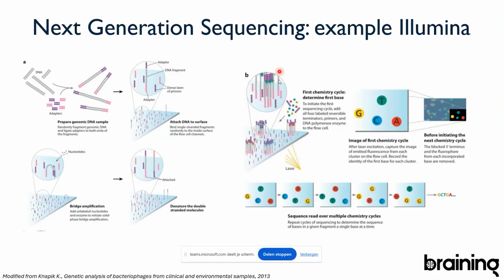And that real sequencing step works in a very similar way as Sanger sequencing. You have some kind of chain termination, right? The difference here is that you use fluorescently labeled bases. So for example, here the guanidine will be yellow, the thymidine will be green, the cytosine will be blue. And the other big difference with Sanger sequencing is that the chain termination is reversible.